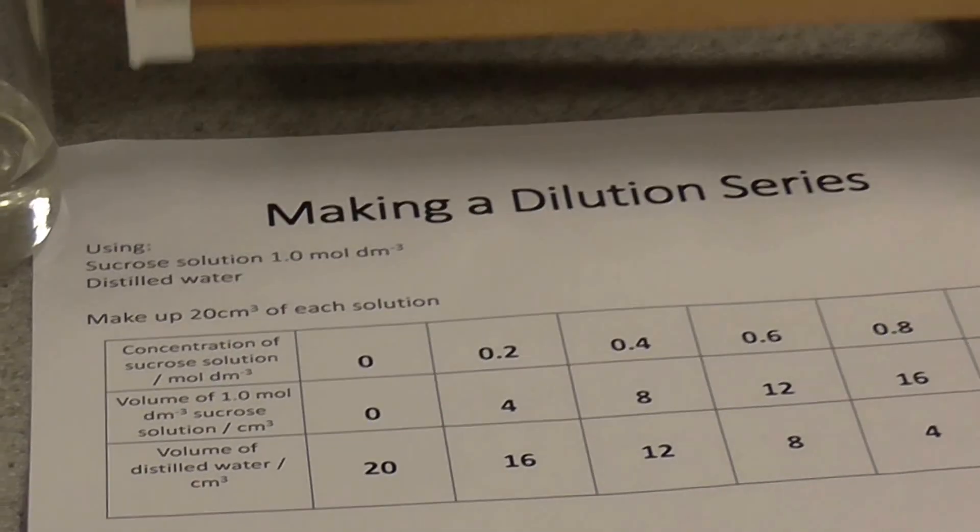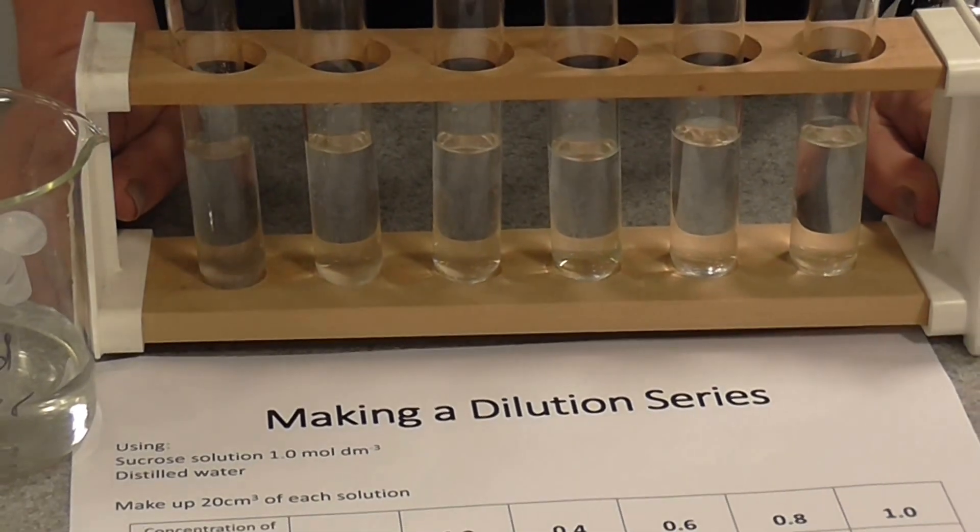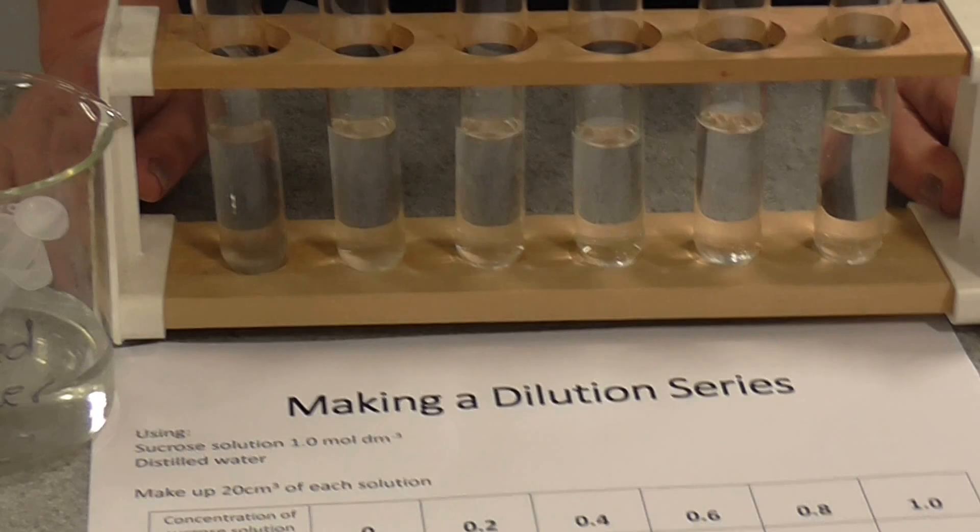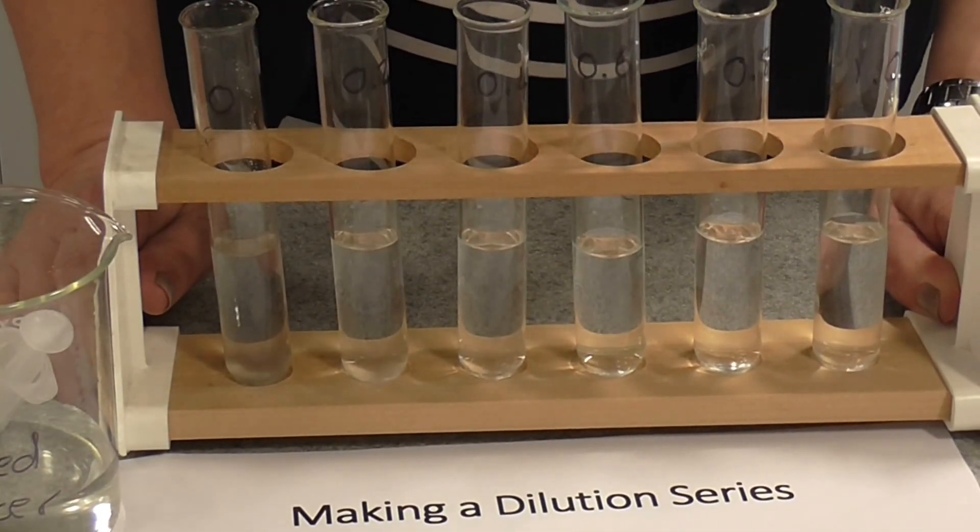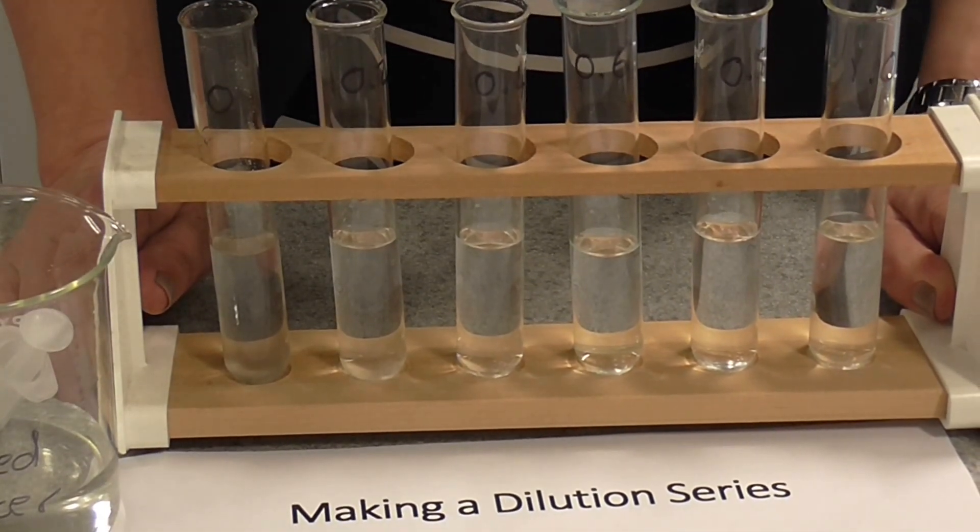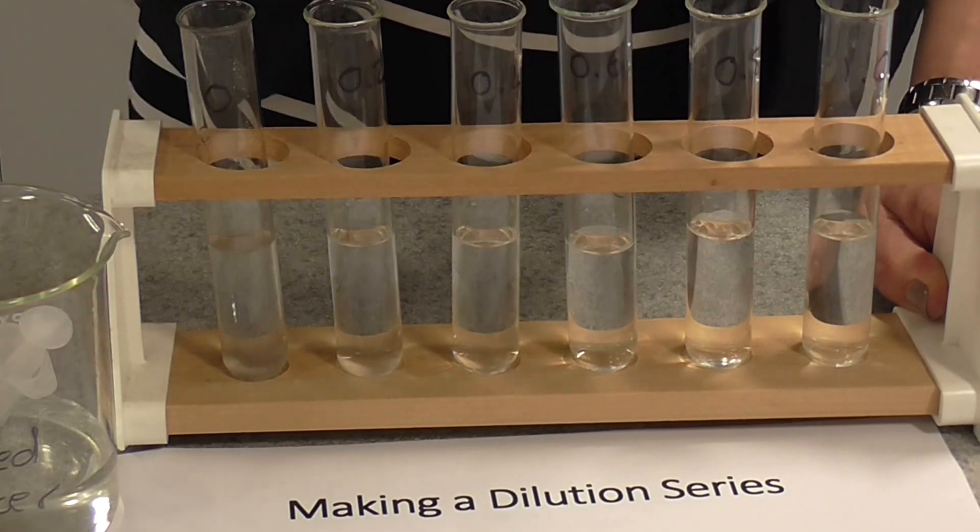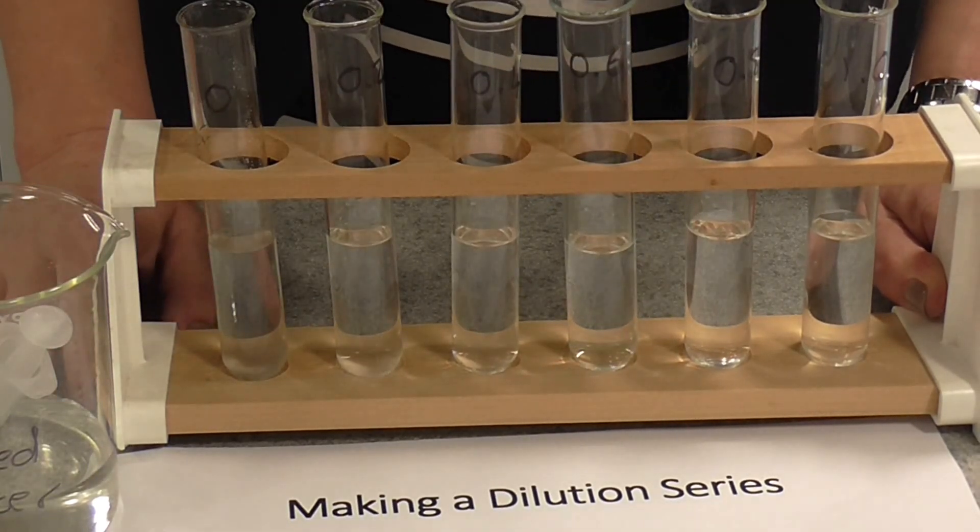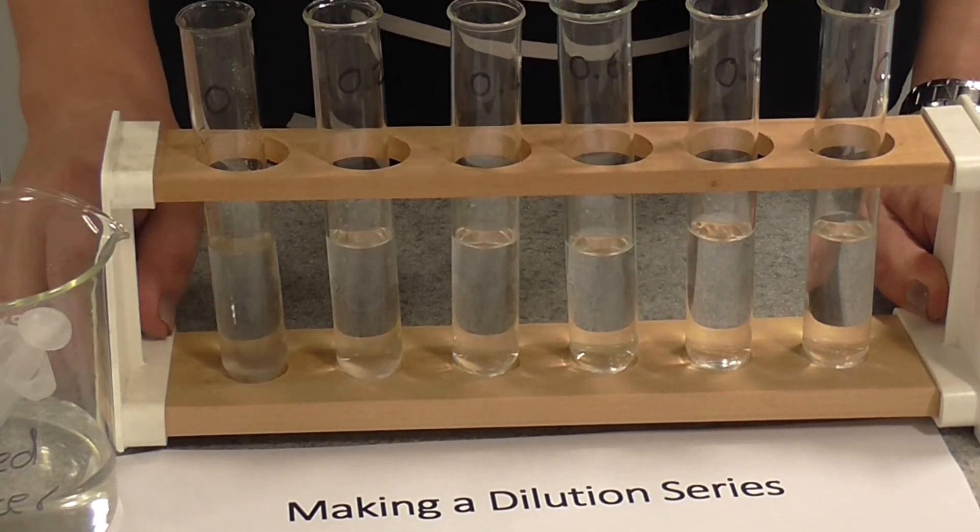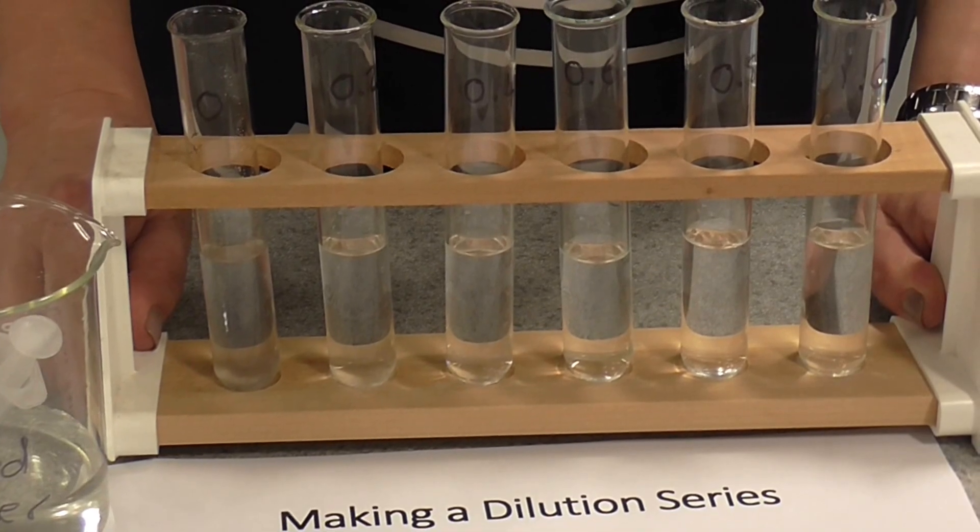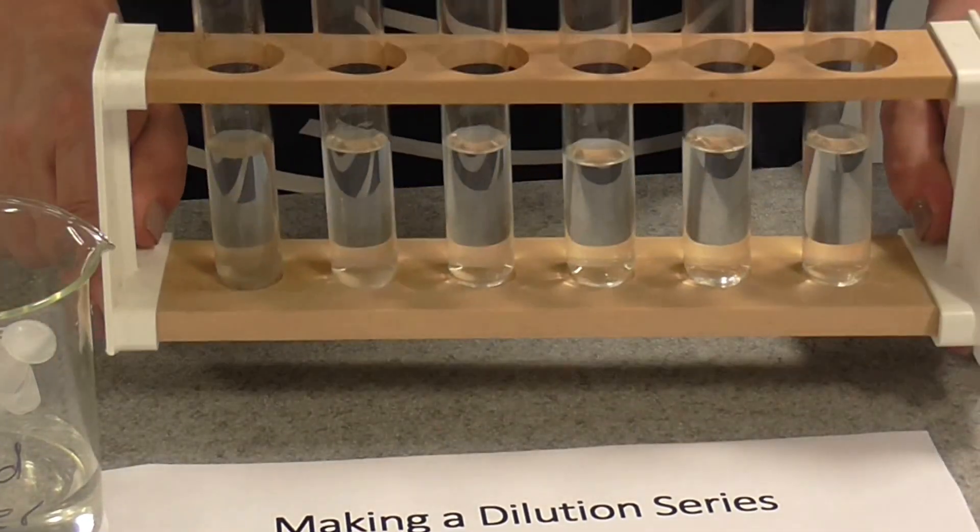As soon as you've done that, and you see I've got that here, your different sucrose solutions now need to go into a water bath to equilibrate at 25 degrees C. 25 or 30 actually both work fine for this experiment. That means to allow them to come to a set temperature so that temperature is not a variable that might affect the results in this investigation. I'll just pop those in the water bath now.